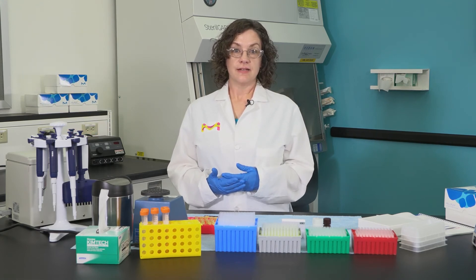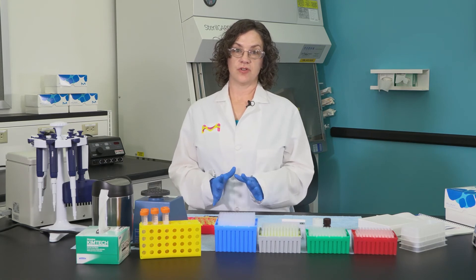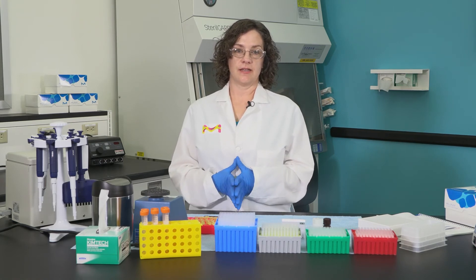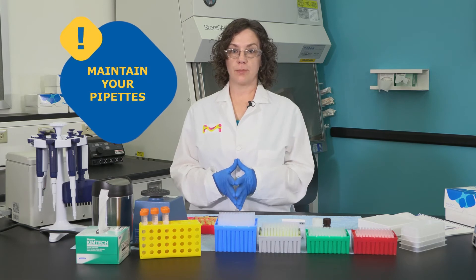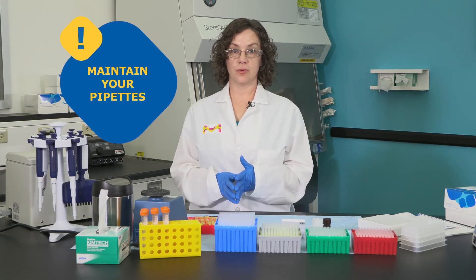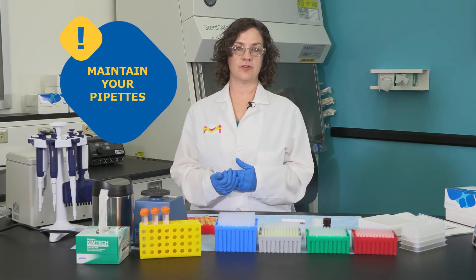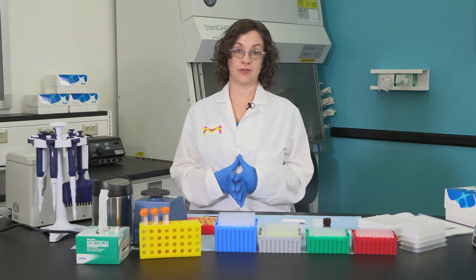A proper and consistent pipetting technique is key to accurate data, especially if multiple users will be generating data in collaboration. Maintaining properly calibrated pipettes is important and training on best practices for pipetting can substantially increase pipetting precision.